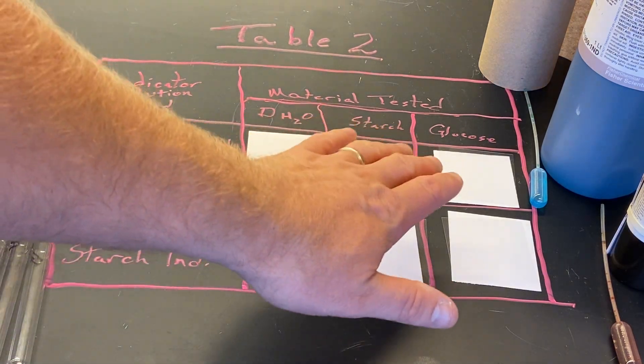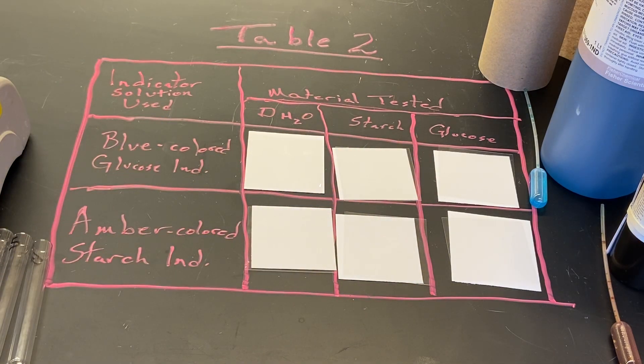Each of these little squares has a white piece of paper with plastic film over it so it doesn't soak in and affect our results. We're going to start with the blue colored indicator solution for glucose, sometimes called Fehling's solution or Benedict's solution.